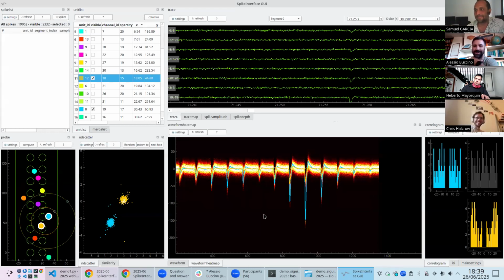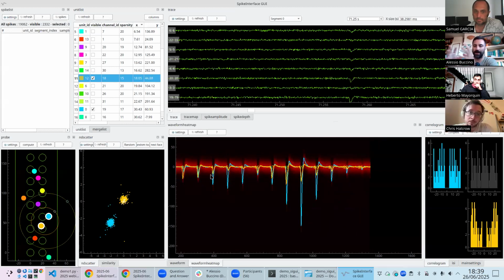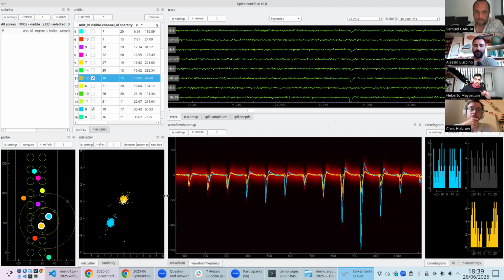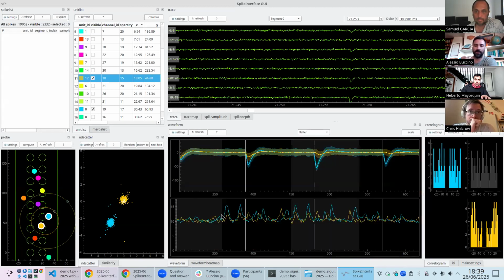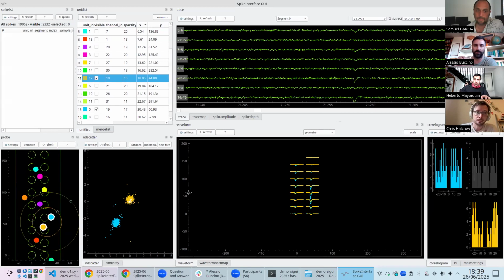But basically, I think it's highly integrated into SpikeInterface, and we have, as you can see, a core development team. So we are actively adding new features and improving this. While Phy works well with Kilosort and Neuropixels data, if you have tetrodes or other kinds of data, it might be a little bit less flexible. And then you'll see later that we can also run these as a web app. And I think this is a killer feature as well. Right, but we can discuss maybe later.